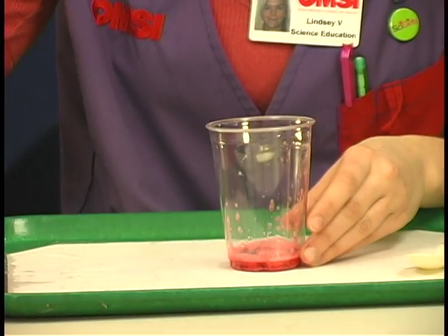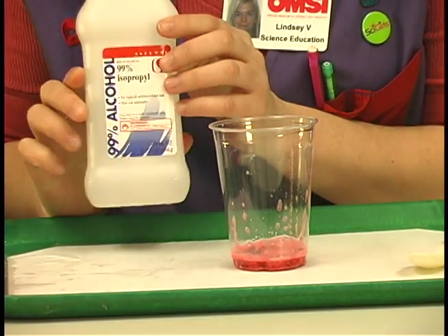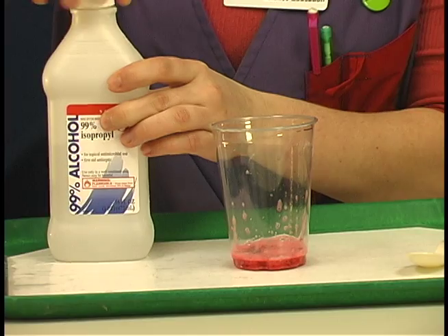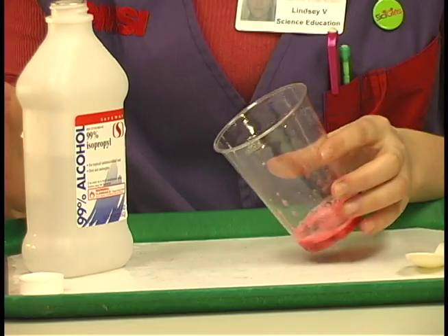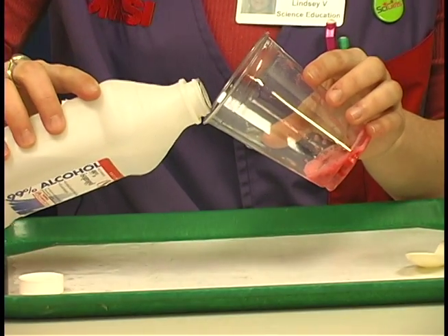Next you're going to need the 99% isopropyl alcohol right from the ice. It's best to use 99% rather than 70 or 90 — you get a better result. The key to this is to slowly pour it over the side of the cup, and you can tilt it like this very slowly.